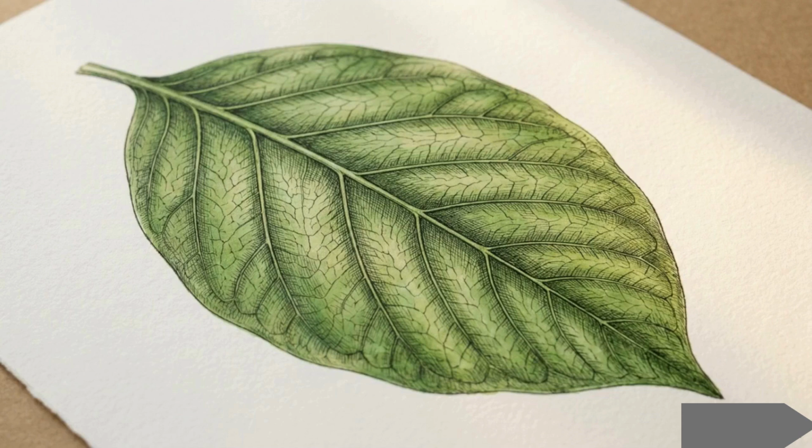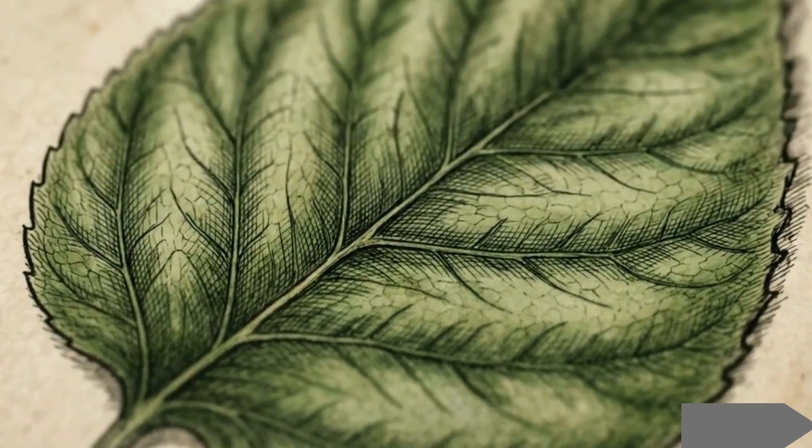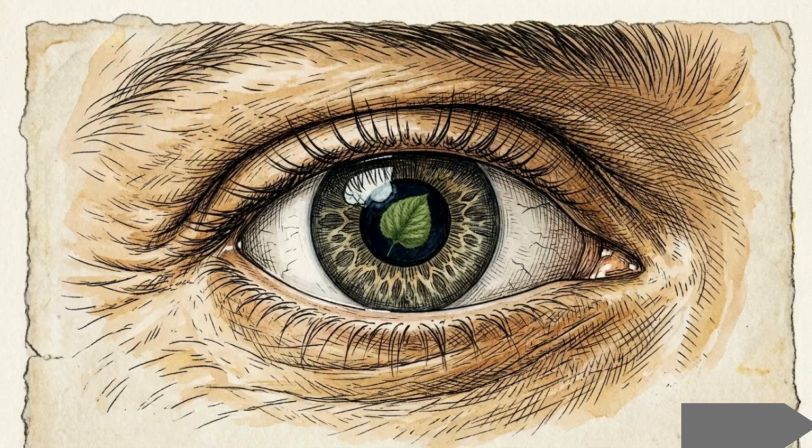When we look at a leaf's surface, we see its green color and smooth texture. But if we try to look closer, to find the actual living structures keeping it alive, our eyes hit a physical limit. The tissues that build plants and animals are too small for the naked eye to resolve.